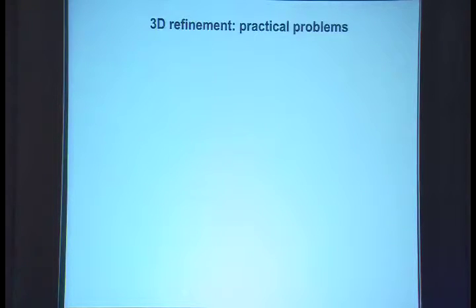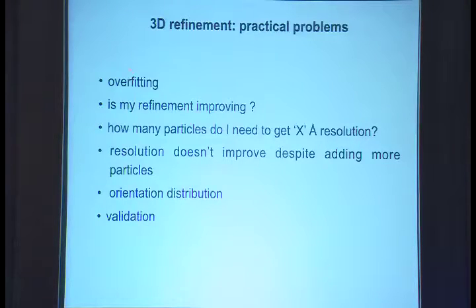Okay, so those were the theory and how the program works. I thought I would also include some of the practical problems which you might encounter when you do the 3D refinement. So these are some of the things which I put here. Overfitting is one thing which is very common. You might have heard from Steve already.